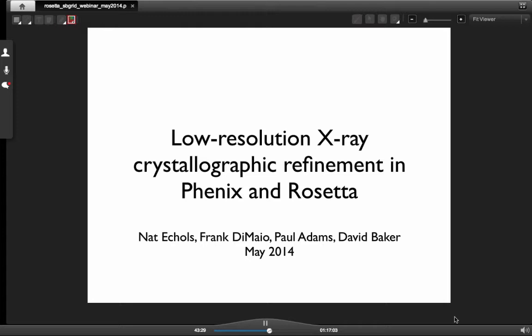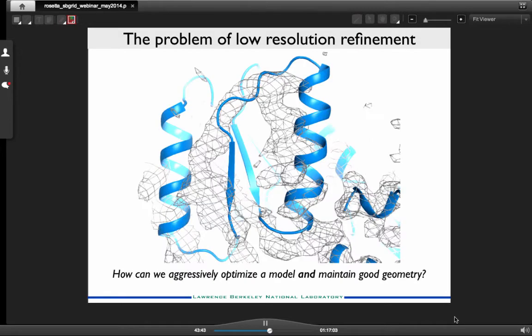Okay, thanks. I just wanted to introduce this by saying this has been a collaboration with Frank DiMaio and David Baker at University of Washington, and it's really been a terrific experience for us because they're bringing in a very different perspective on how to deal with macromolecular structures. So the problem we're specifically trying to address is how to optimize a poor model at very low resolution. And what we need to do is simultaneously move the model into the correct electron density, refine it against reciprocal space data, but also maintain good geometry while we do that.